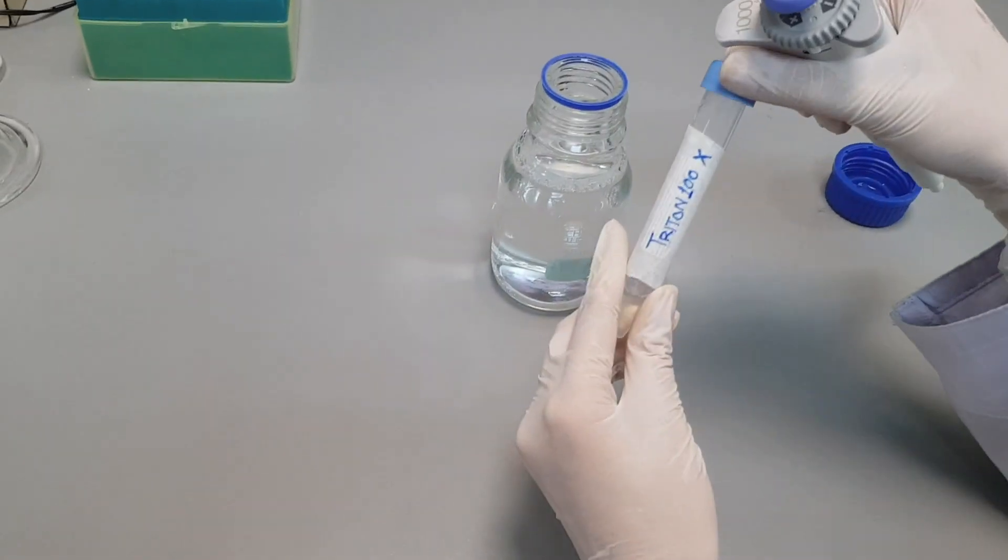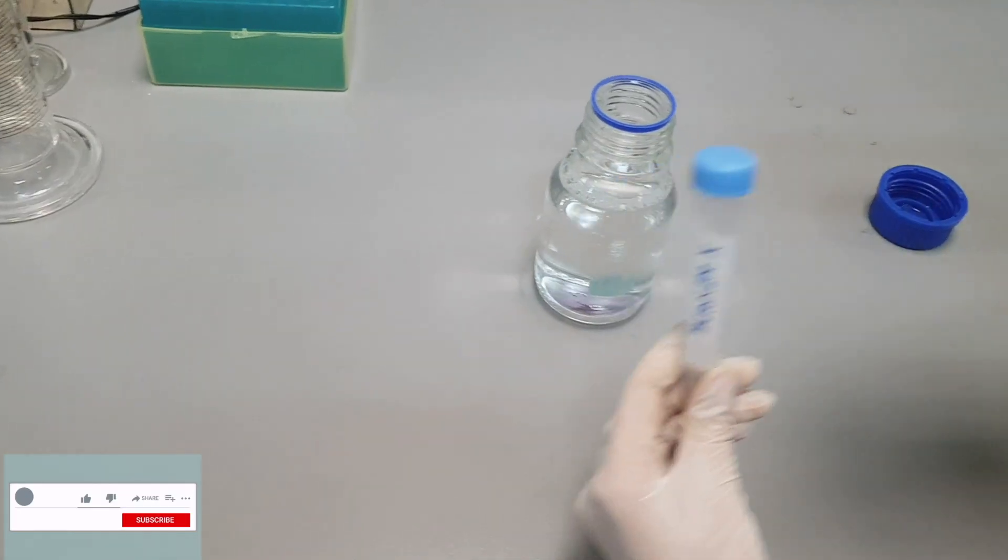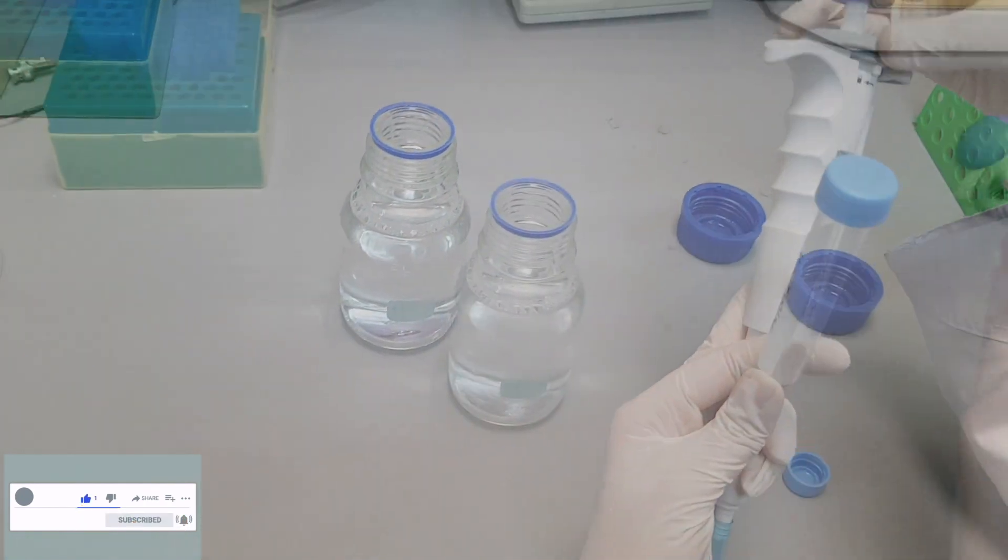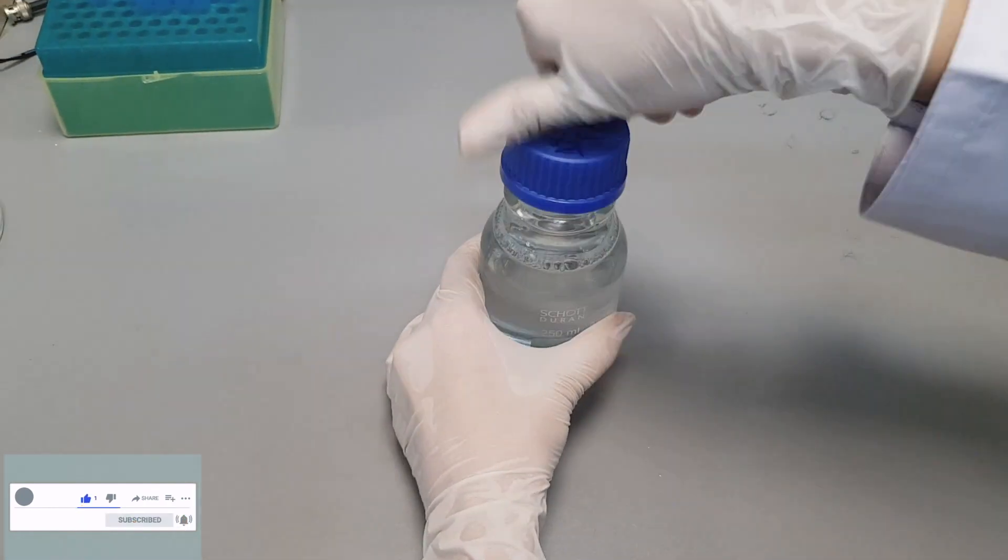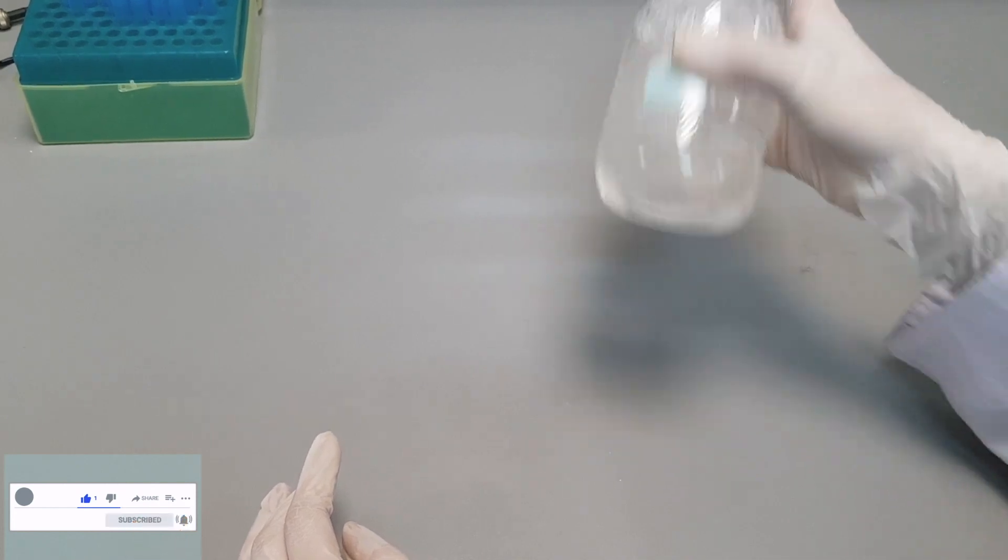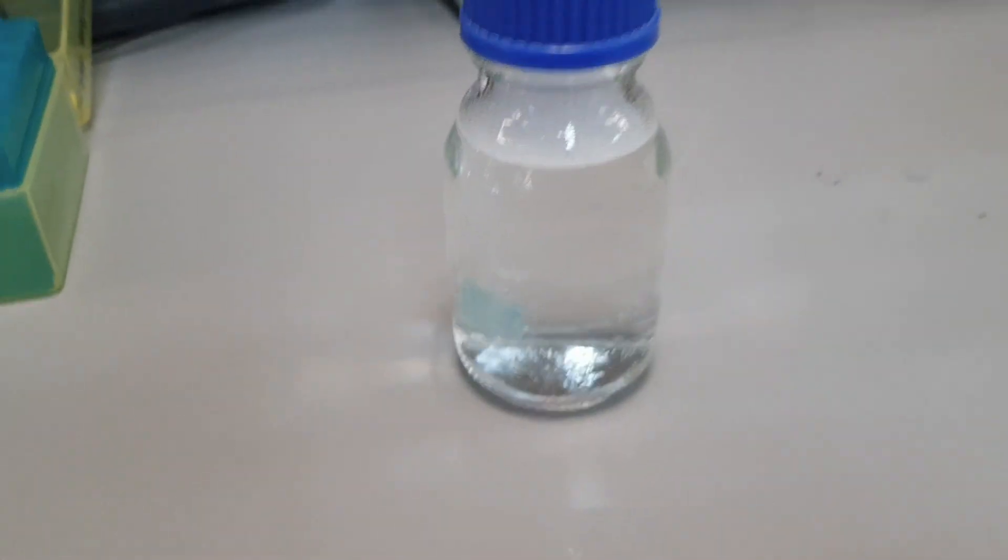After being autoclaved, add 2.5 ml of Triton 100x to this solution and mix it well. Then leave it for 15 minutes. Our solution A is ready to use now.